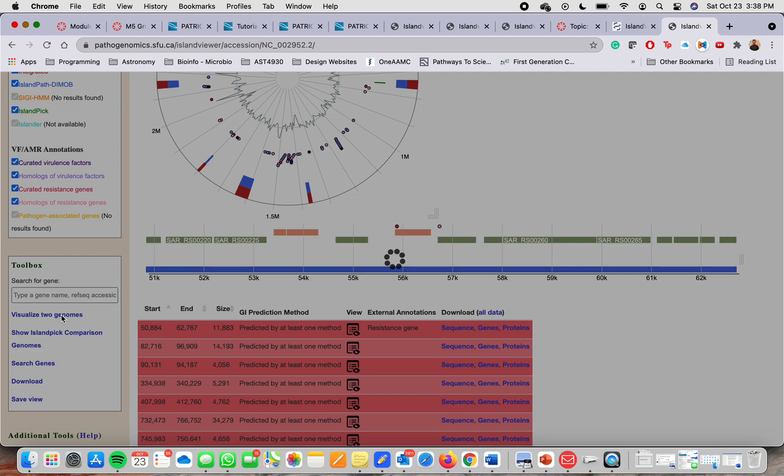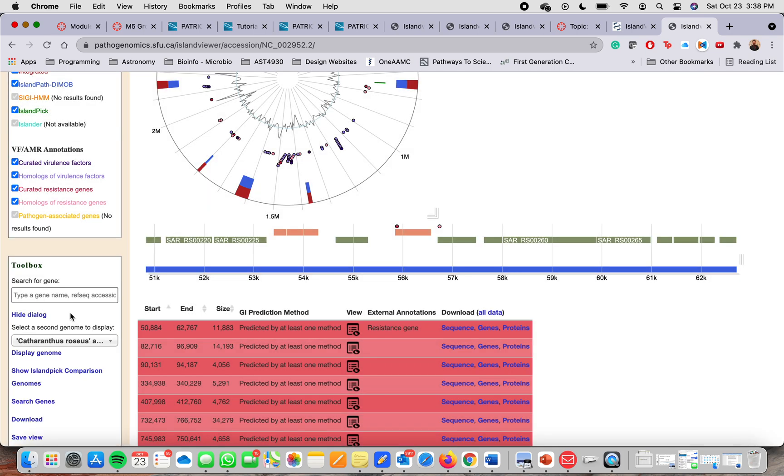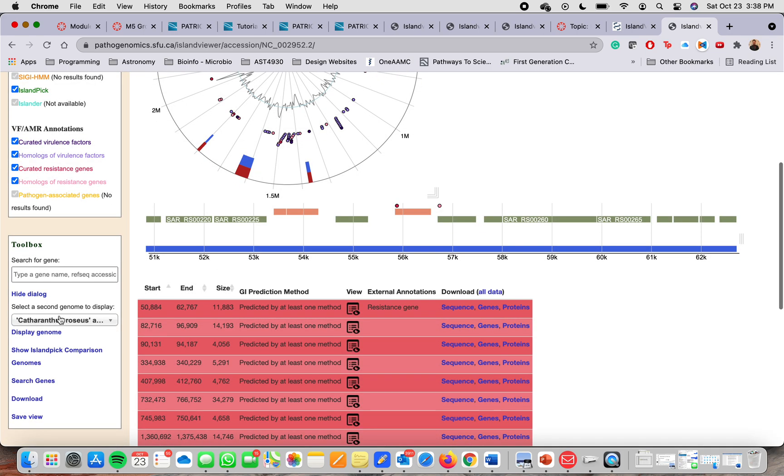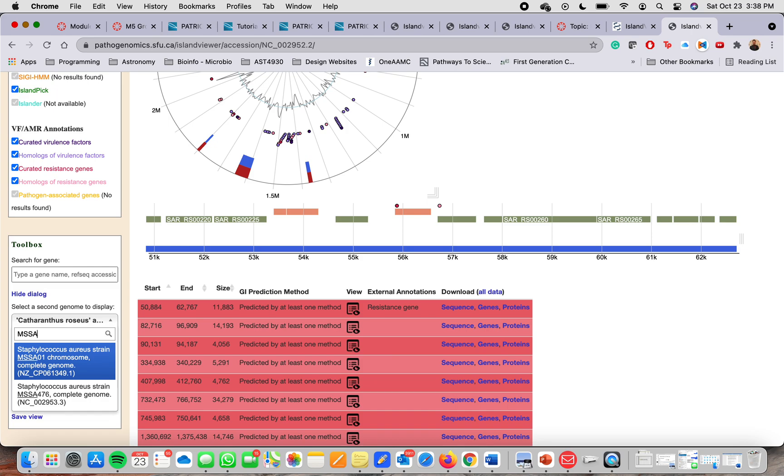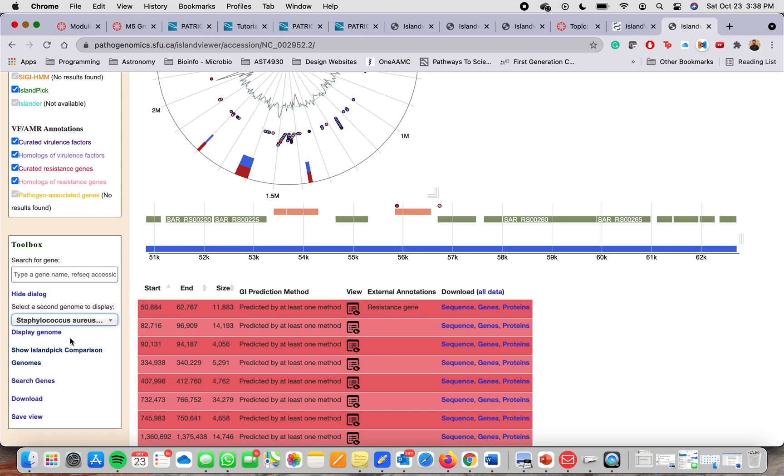Then it will ask you for the name of the second genome. And we know that it is MSSA 476. It will show there, you click on it and then you click display genome.